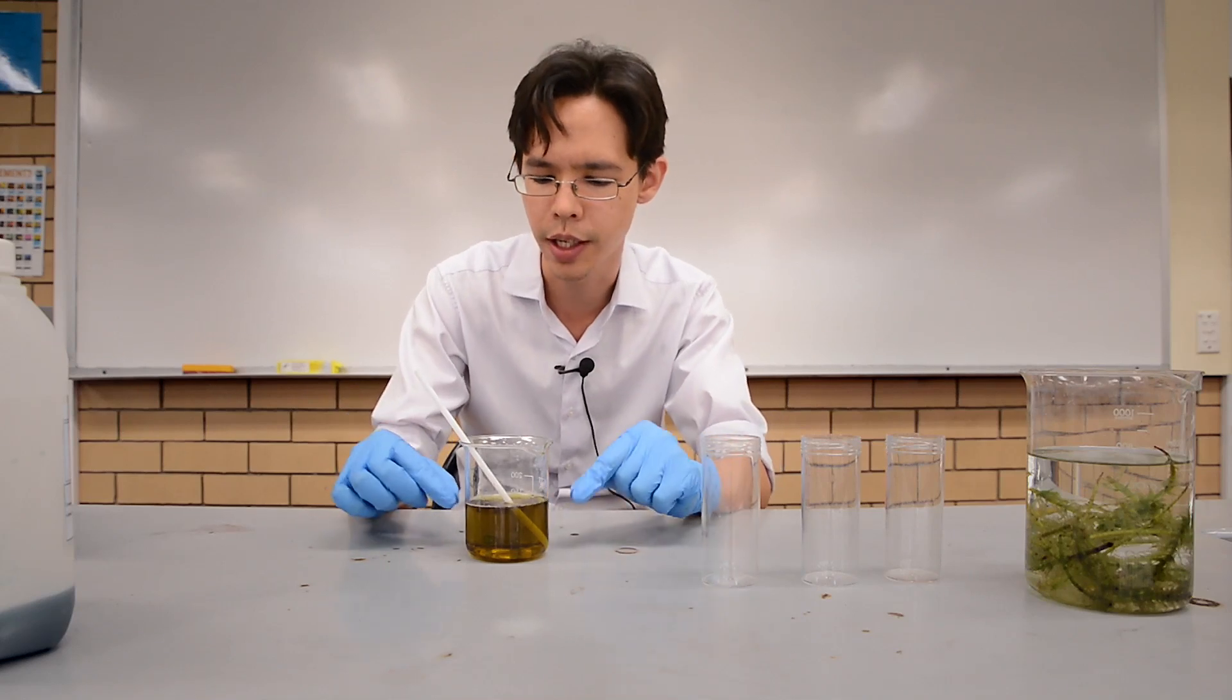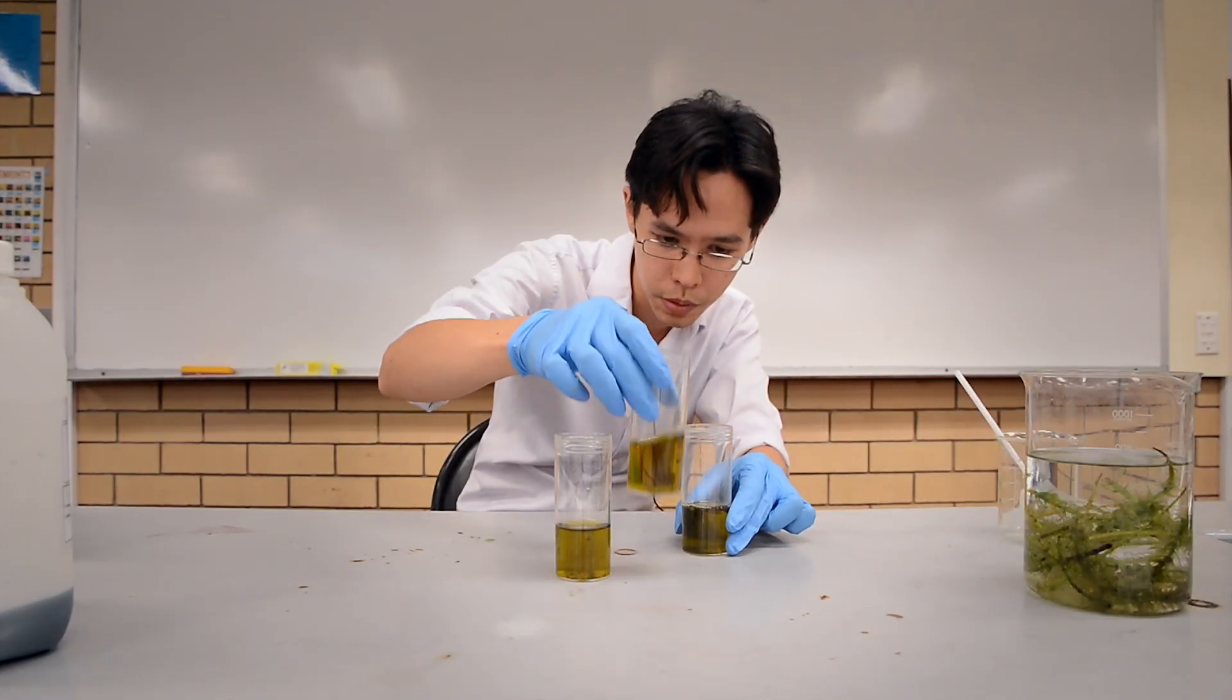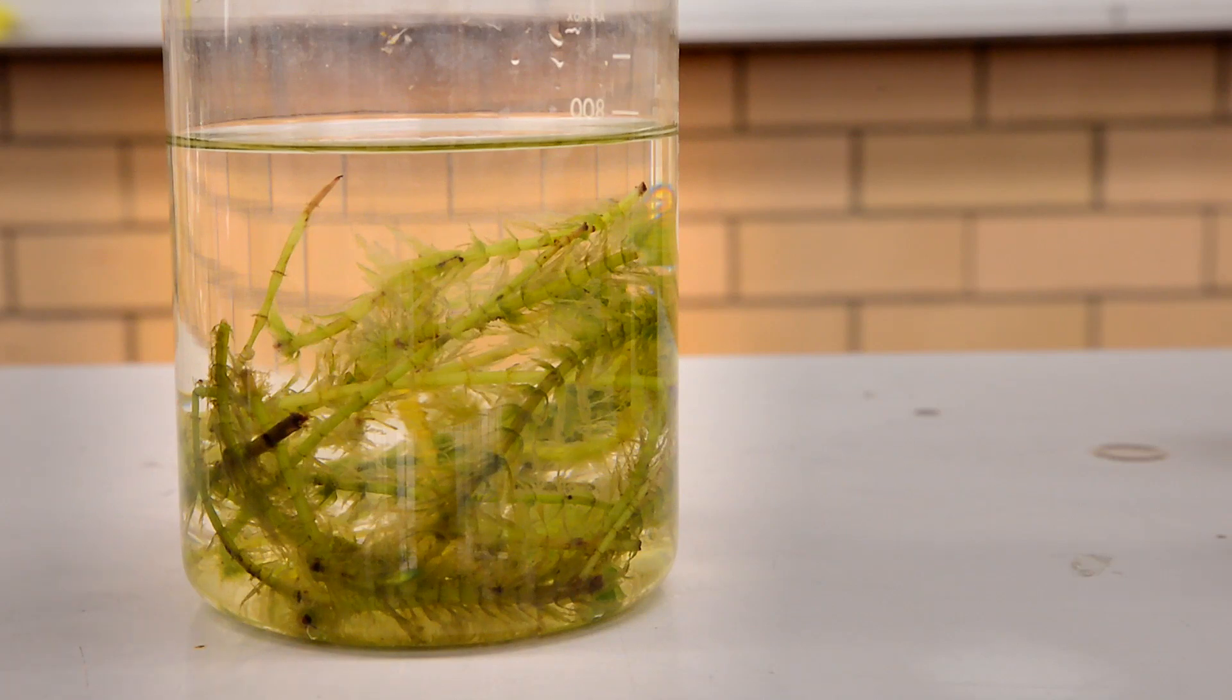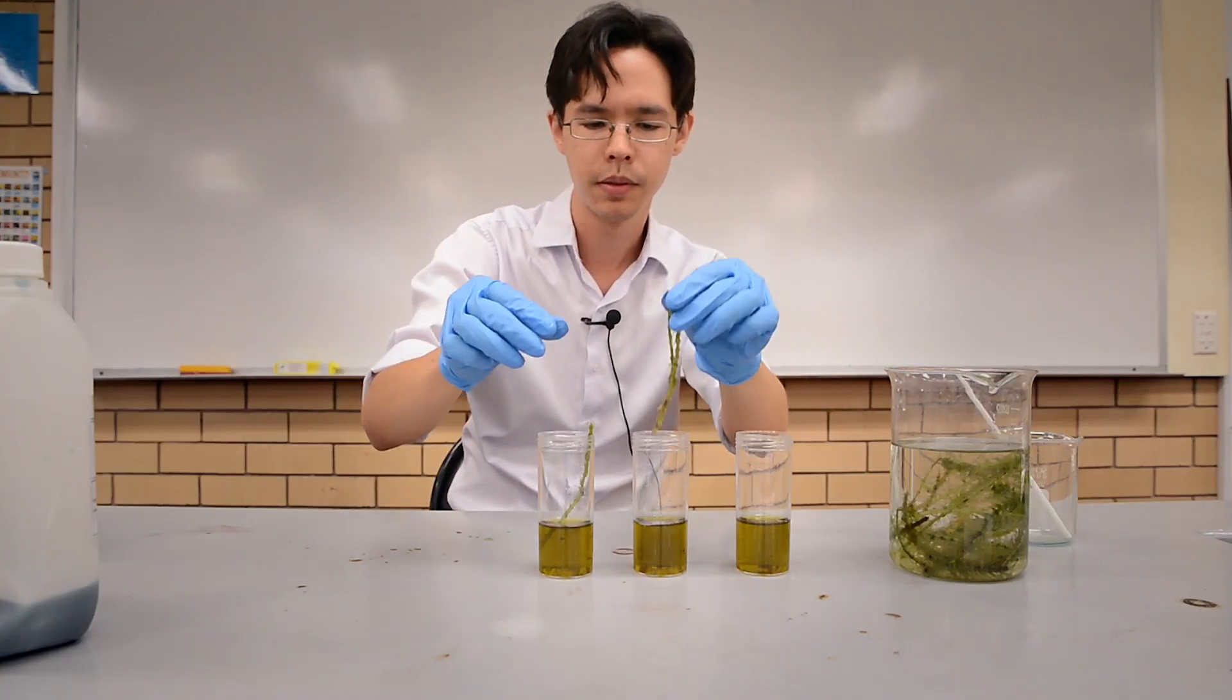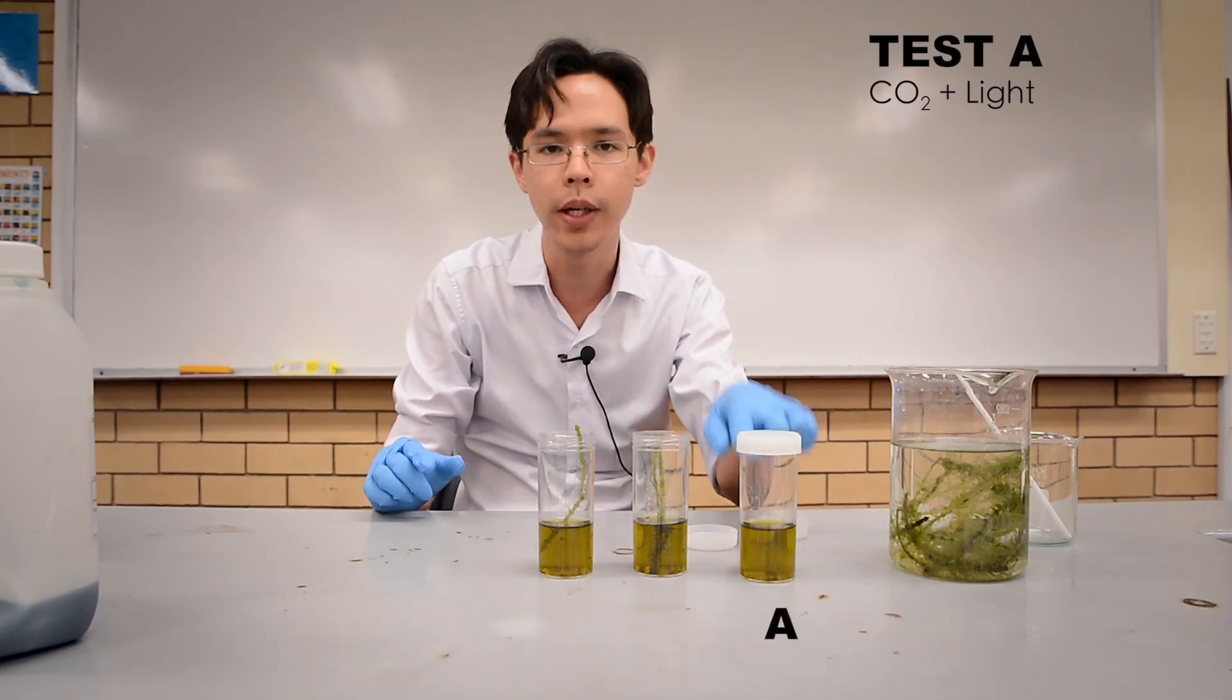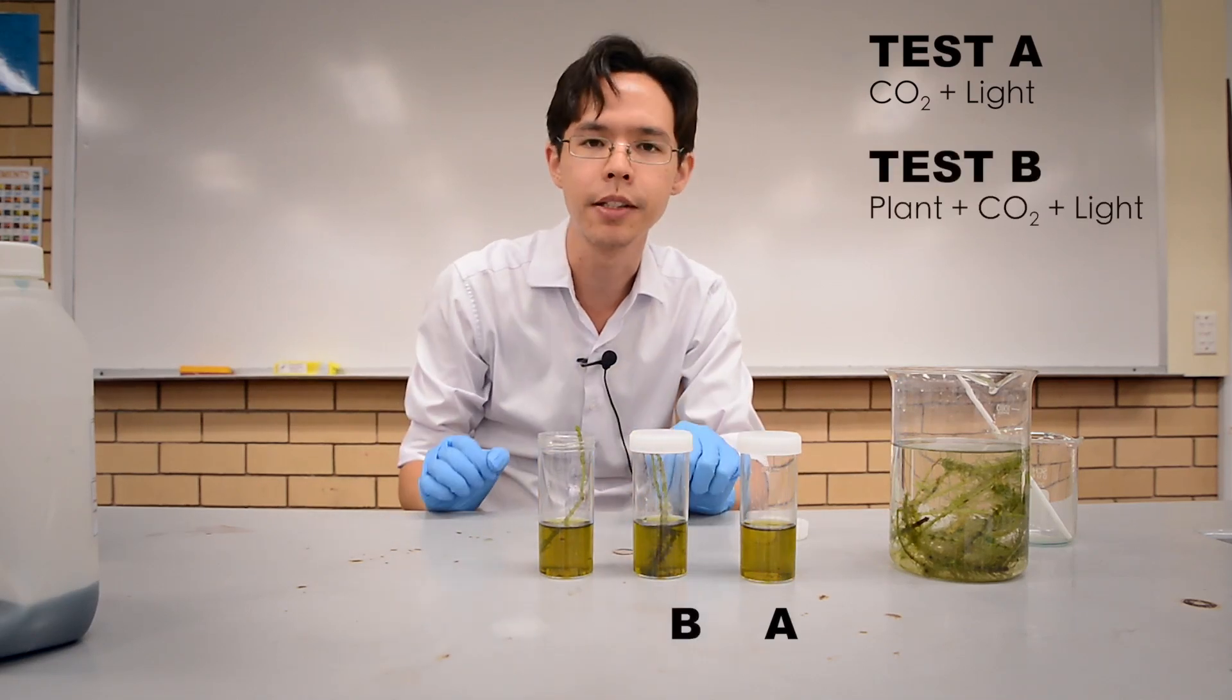A solution is just what we call things in chemistry that's dissolved in water, and it can be a mixture of things. So now I've stored this carbon dioxide in the water. If I just leave it there, it'll actually start to escape. So I'm now going to pour off an even amount of liquid into each of these jars. Now we need to take our plant and expose it to different conditions. The plant we will be using is called an Elodea.